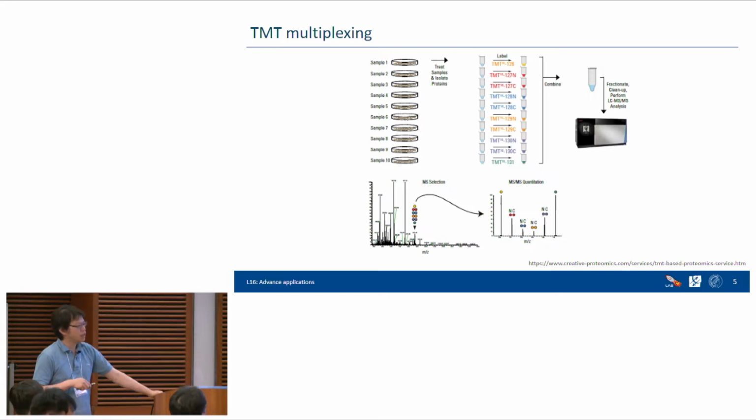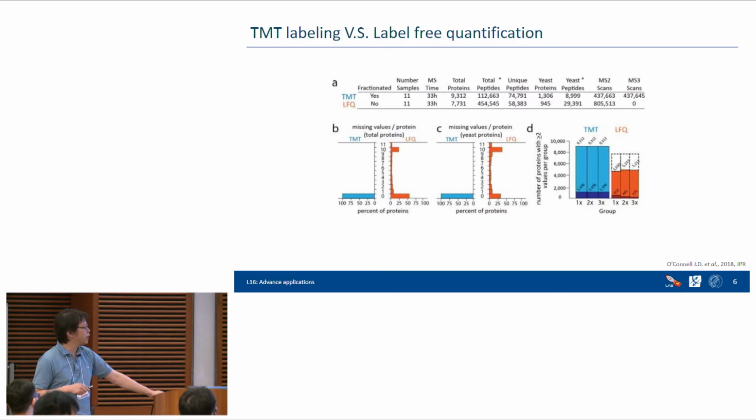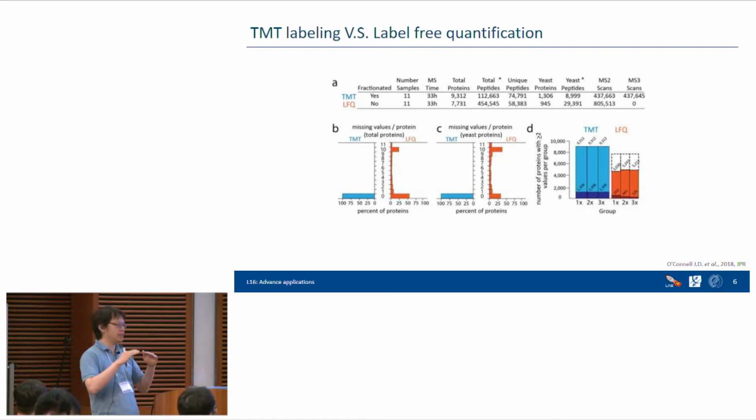So this is the TMT structure. You can see the reporter region has a cleavable linker, mass normalizer, and then peptide reactive group. Basically, you attach to peptides, and we have different masses of reporter and use mass variance so that every tag keeps the same total mass.